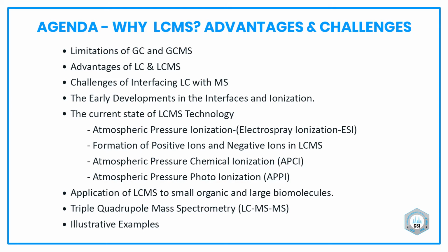If 2 or 3 components go into the mass spectrometer, it will give you the values corresponding to the mixture of 3 compounds. So it can separate ions, but it cannot separate your compounds. If you have a mixture of 2 compounds going into the mass spectrometer at the same time, and it gives you 2 molecular weights, you can say that, yeah, it's a mixture of these 2 compounds. So it can do an ion separation, but it cannot do a physical separation of your mixture.